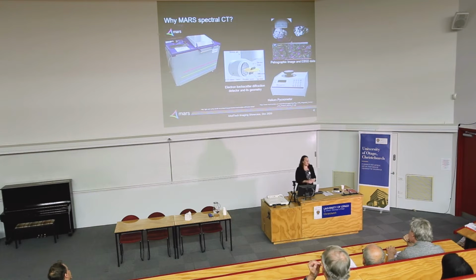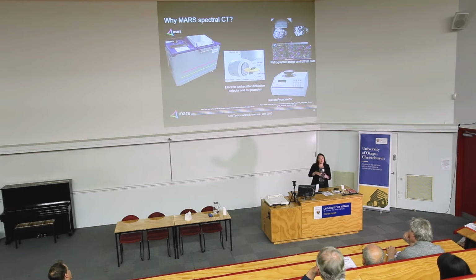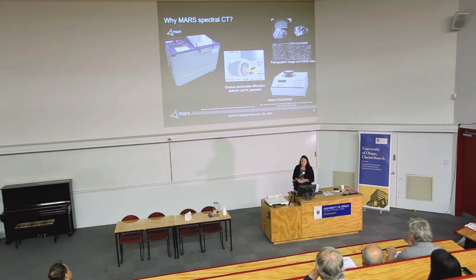Then we've got the helium pycnometer, and so this pumps a known gas, helium, into a rock sample to provide us with the connected porosity. But this doesn't take into account the isolated pores, and so without grinding down the sample into a powder to find the solid density, we wouldn't get an accurate measurement of the total porosity.